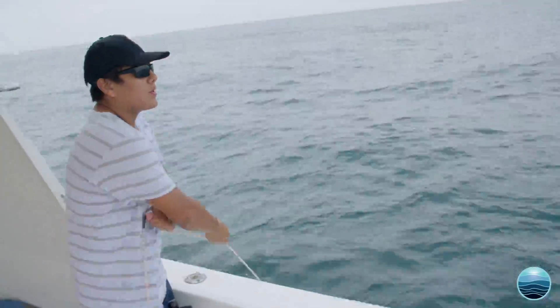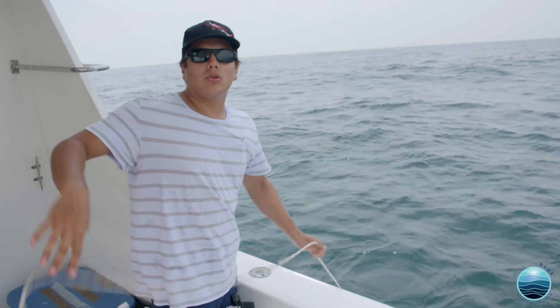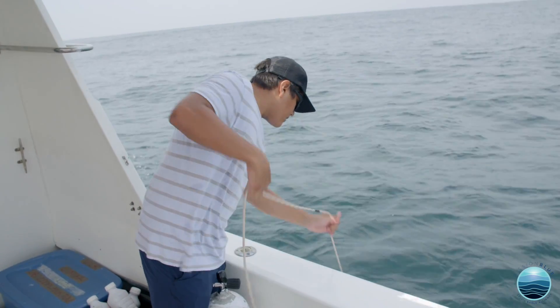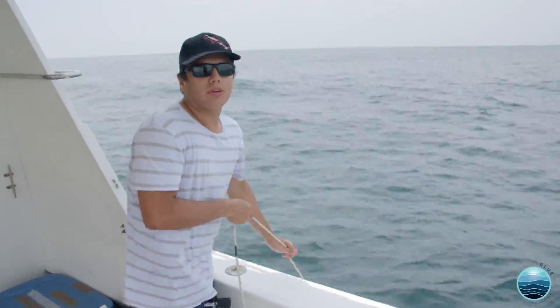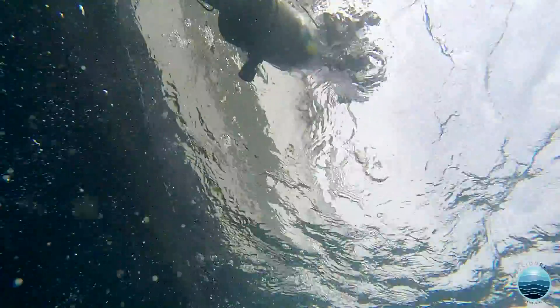Now we just pull it up. One thing is that we want to get the sample from depths where the water is really cold, because those organisms, those species, are probably going to be different from the ones that you find at the surface. So you pull the bottle.